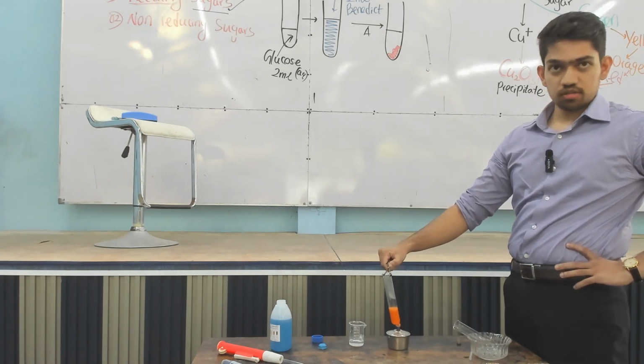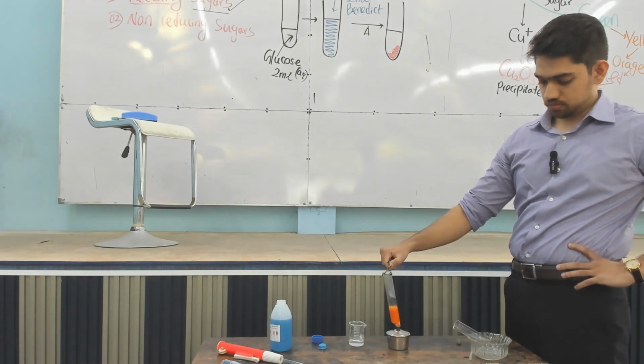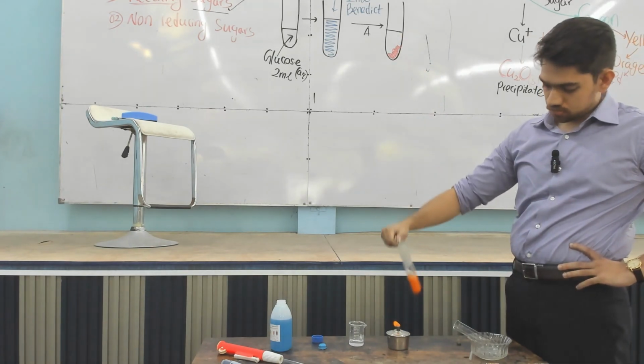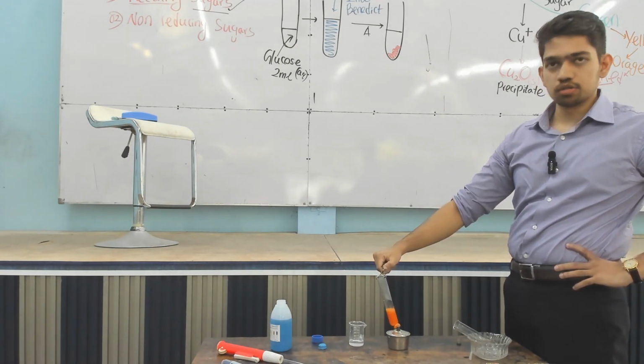It didn't boil yet. That's the problem with this: it's a small spirit lamp. I think we have to be satisfied with that, either orange.